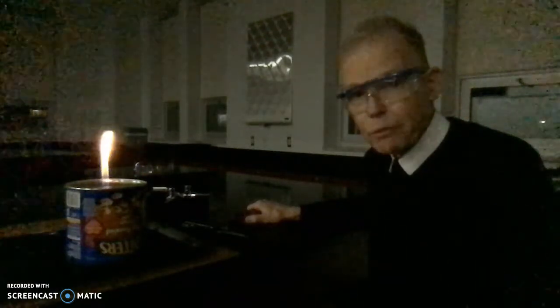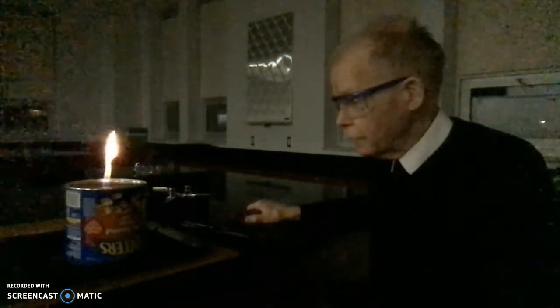At some point, that mixture is going to become perfect for a reaction that is a combustion and a little bit more. So let me pause the video at this point, and when I bring it back, you'll probably see less flame, and we'll be closer to the finishing of the combustion.